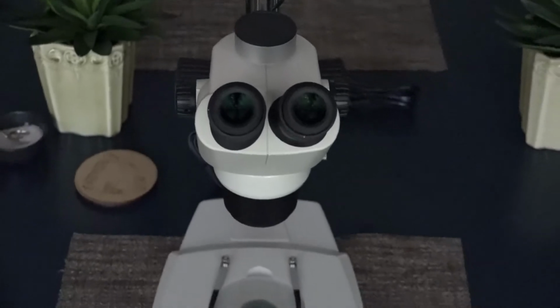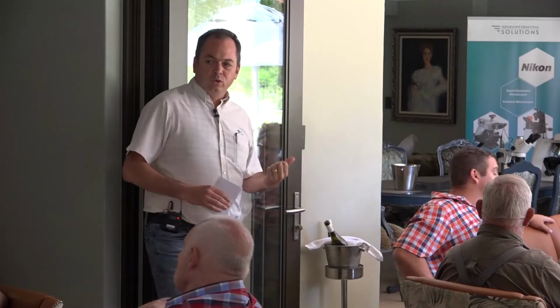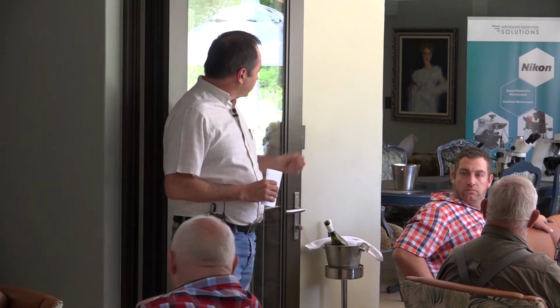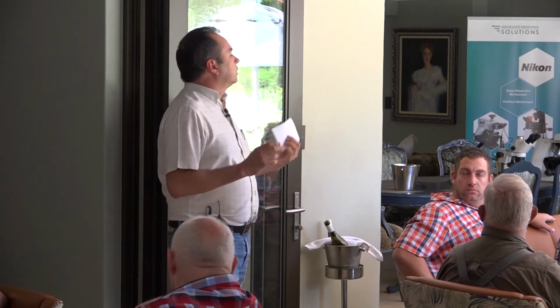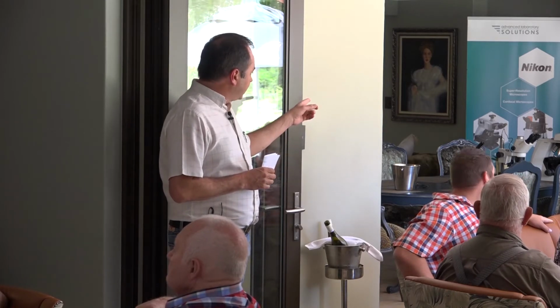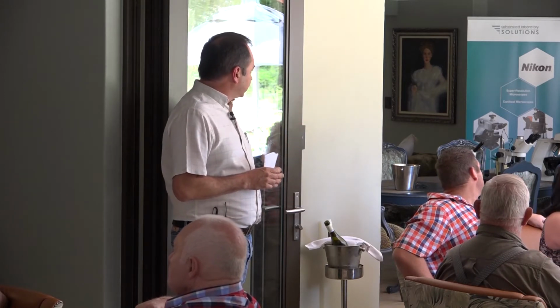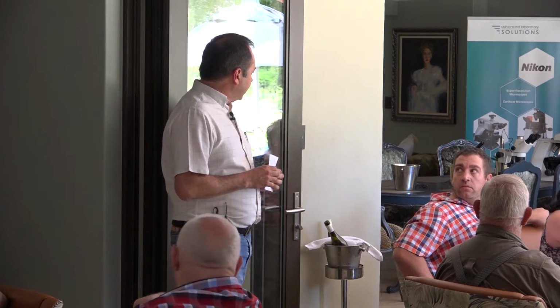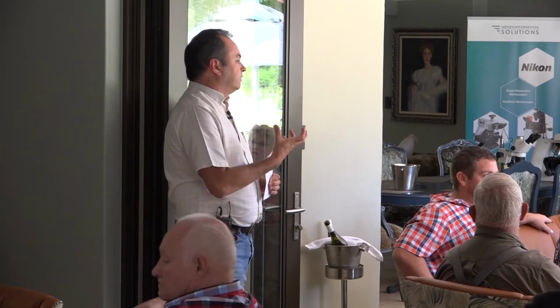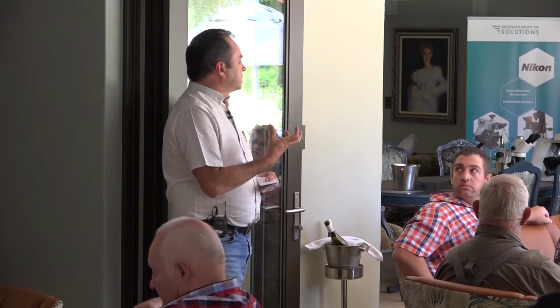The best way to describe where you would use one or the other is that a stereo microscope, the one in the middle, is, let's call it, a glorified magnifying glass. You'll see what I've put there is ordinary salt crystals in the middle one. And it's actually quite interesting to have a look at it. And the word stereoscopic, stereo, we know from our radios, is you get two views. So you get a 3-dimensional image.